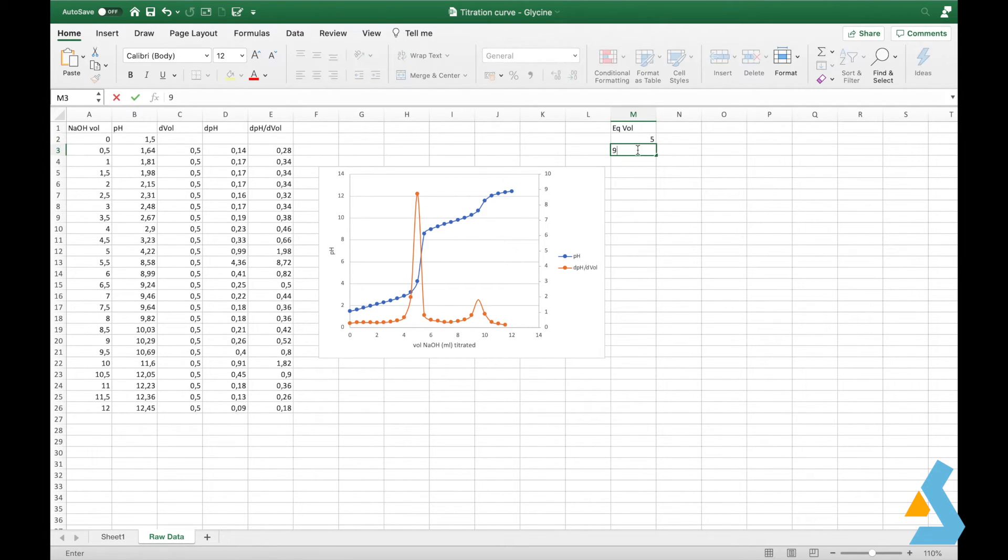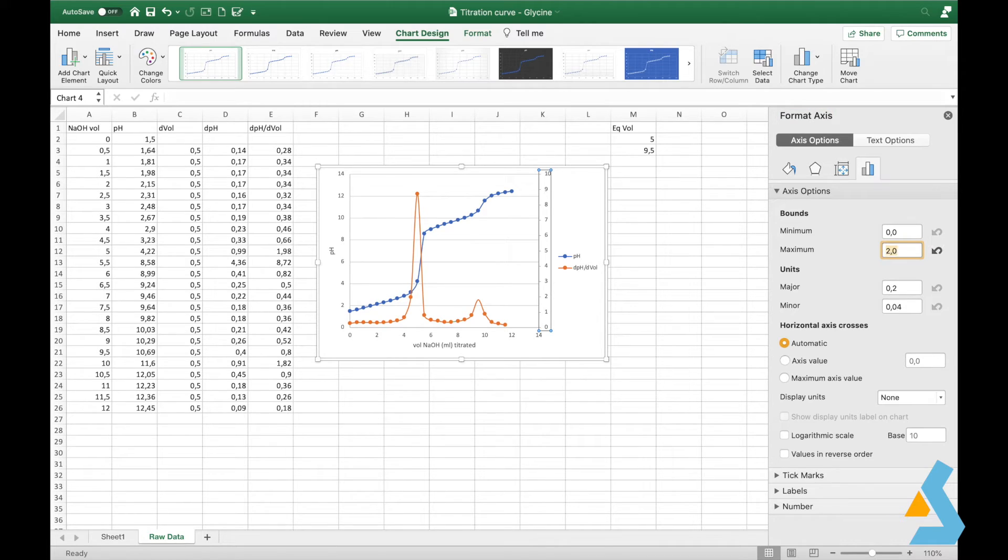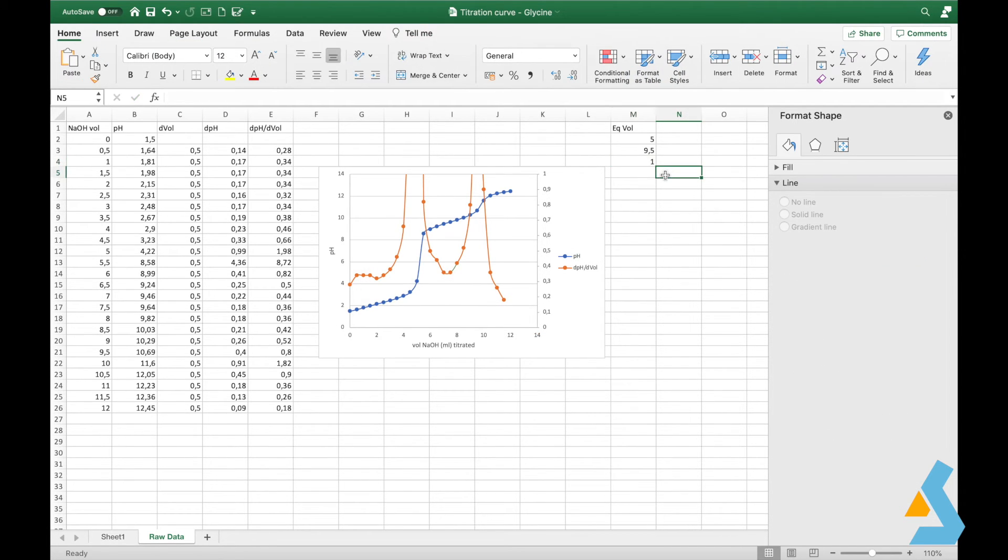To see the other one, we can zoom into the graph. To do that, we can change the range of the secondary y axis of the derivative plot. Now that we can see the third equivalence point, we then record that as well.